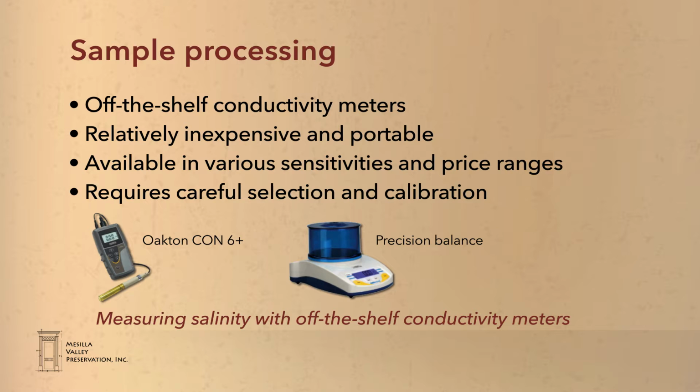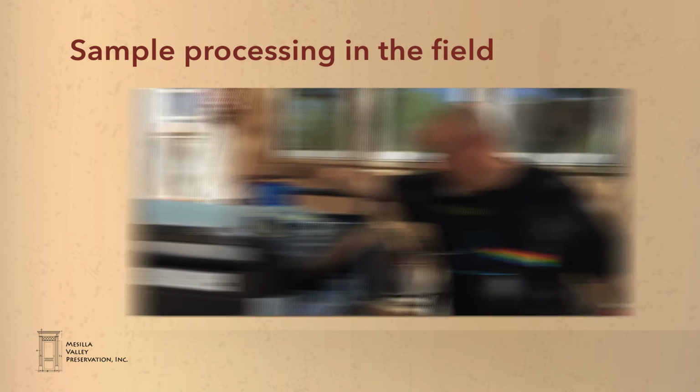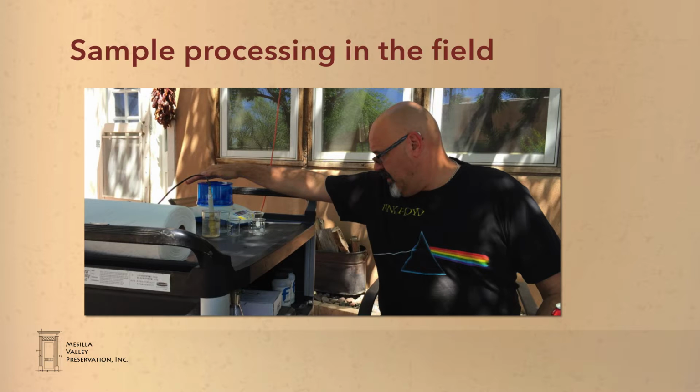Our process also involves calibration of the meter to compensate for any non-linearity in the signal produced by the meter. Dr. David Rockstraw is our principal investigator, and he designed our sample processing kit to be portable and as simple as possible to operate in the field, while retaining considerable precision.